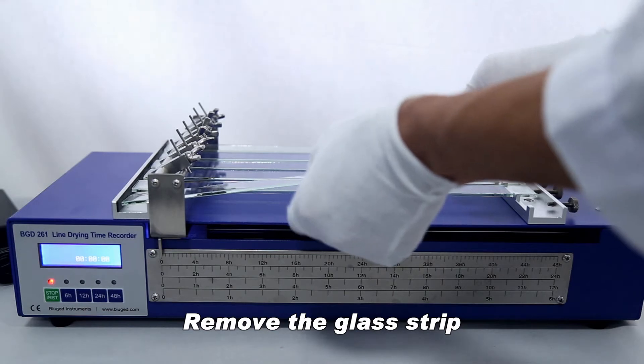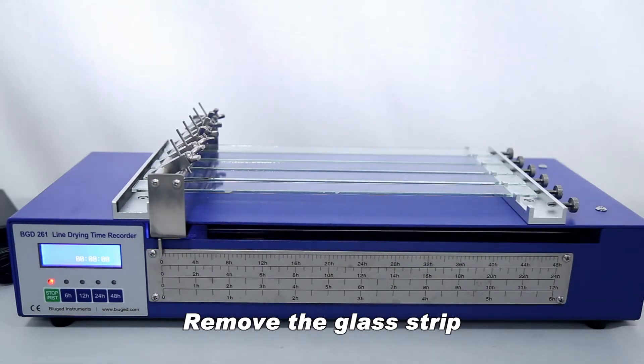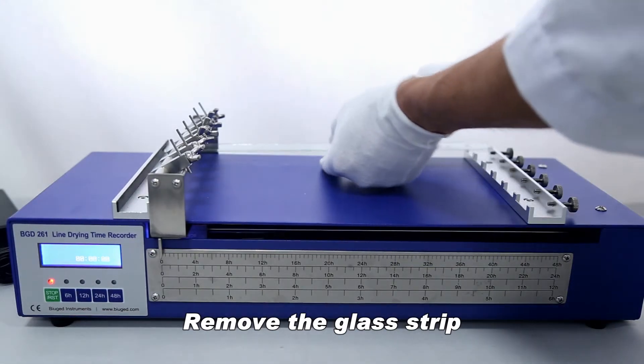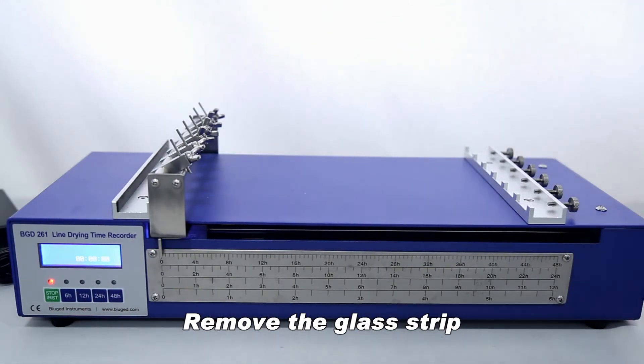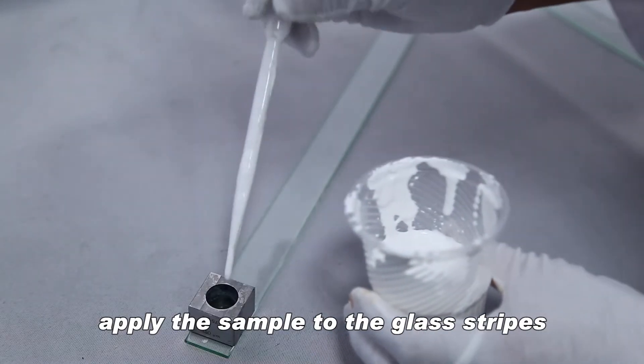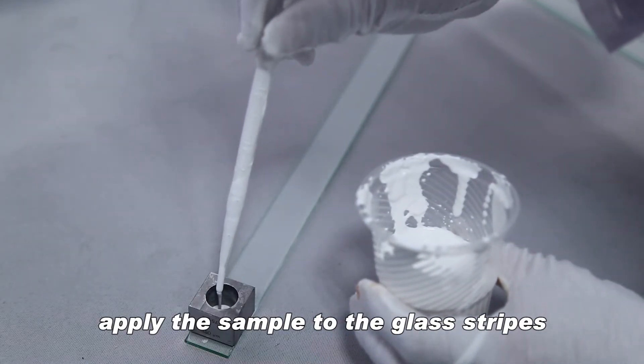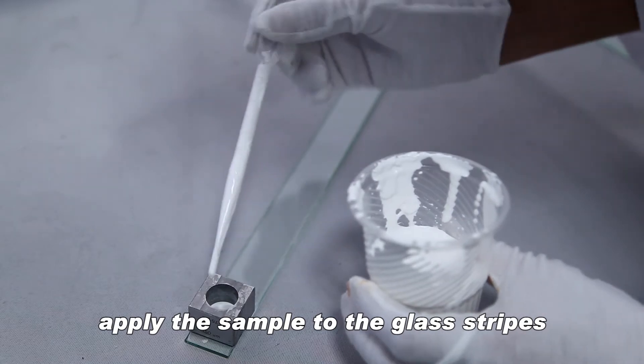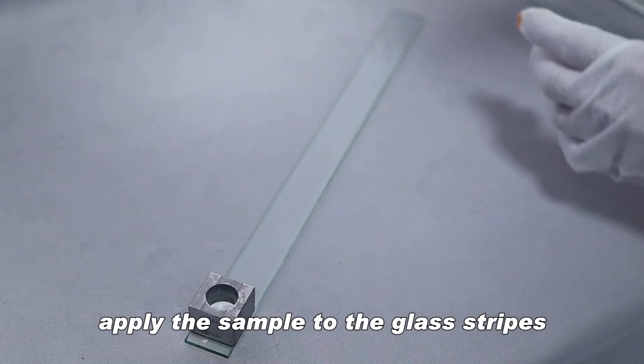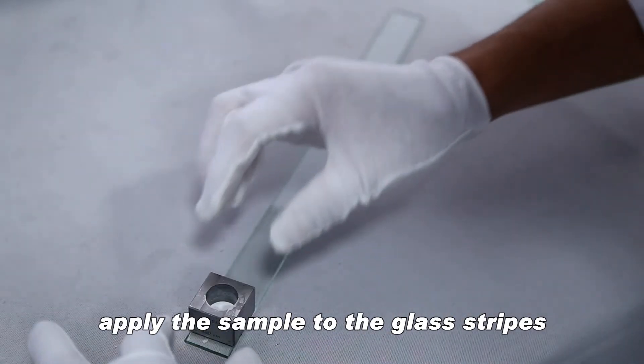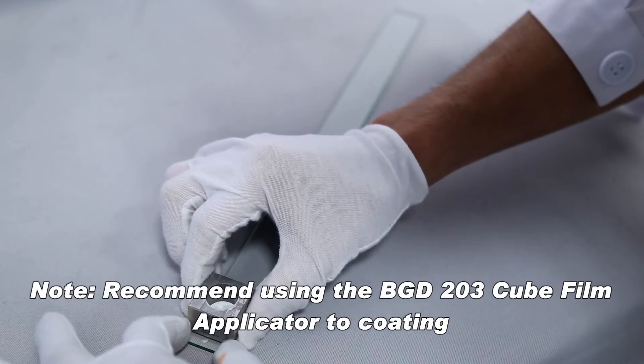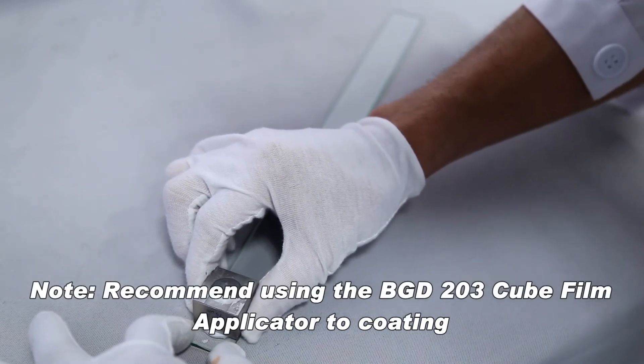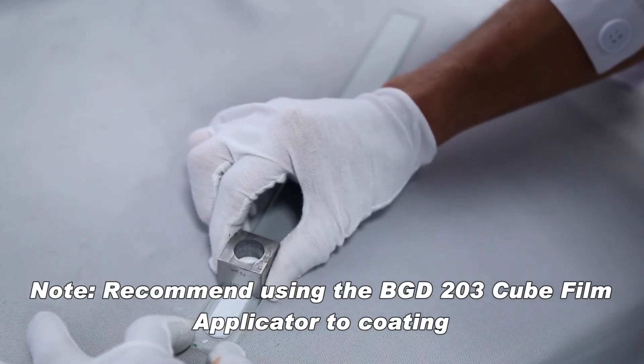Remove the glass strip. Apply the sample to the glass stripes. Note: recommend using the BGD-203 cube film applicator for coating.